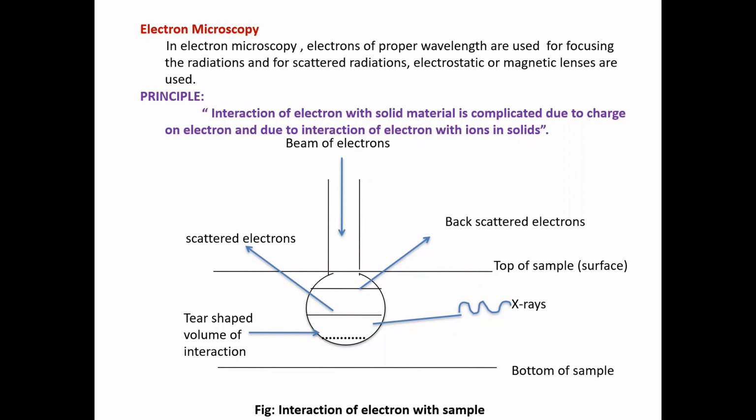When we took the example of the rotating crystal method, you were rotating the sample on the mounting table.